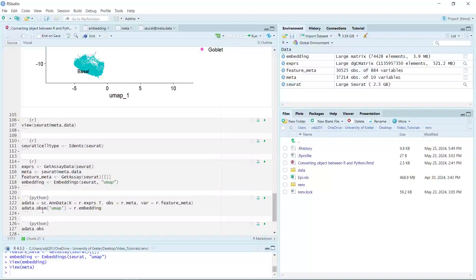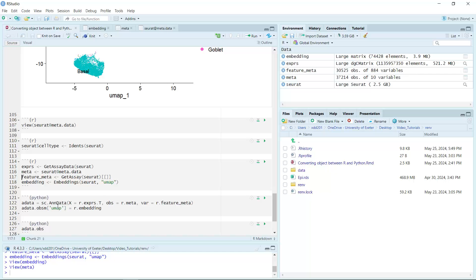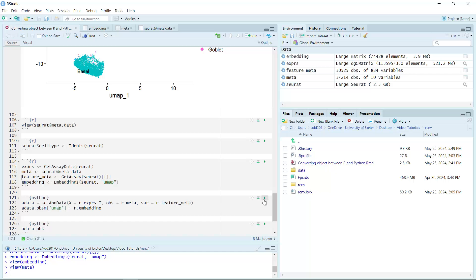There are multiple layers of observations. If we run this code, we will create an AnnData object. Let's run.